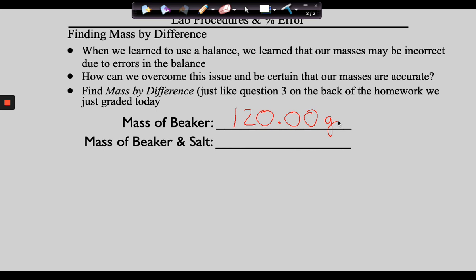And we do include those zeros because while they are not there to change the value of the number, they communicate accuracy. By the way, guys, how many significant digits? Five. Yep. Those two zeros on the right are final zeros after the decimal. The other zeros are trapped, so that's all five. So then, guys, imagine that we add some salt and we come along and we reweigh this. And now this weighs 121.23 grams. What does the salt weigh? 1.23 grams.